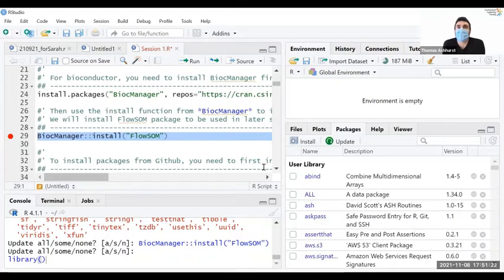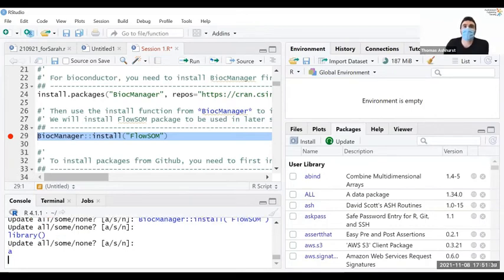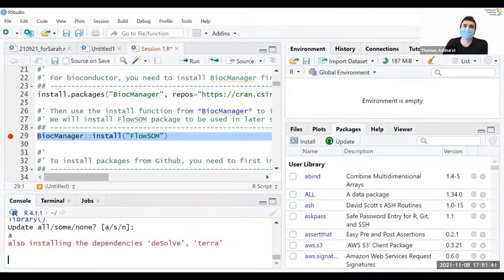Oh yeah, that update thing. Yeah, that happened again. Just put your cursor on the console and press enter. If you click down here and backspace over library, you'll need to type in A and hit enter. Oh, probably should have gone for A. My mistake, don't worry, it's fine. It'll update a couple of packages.